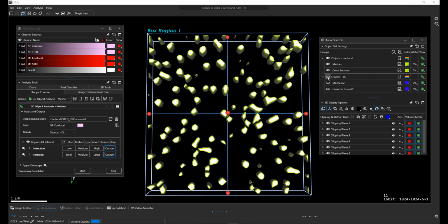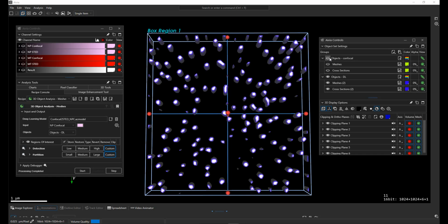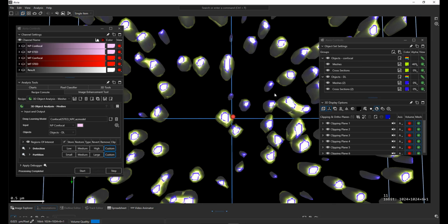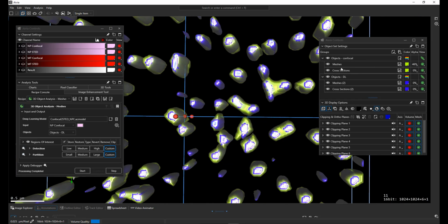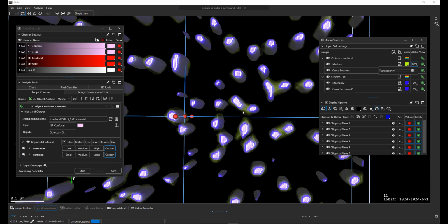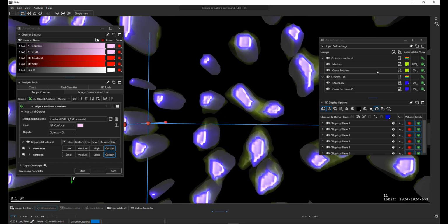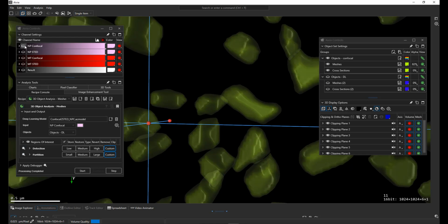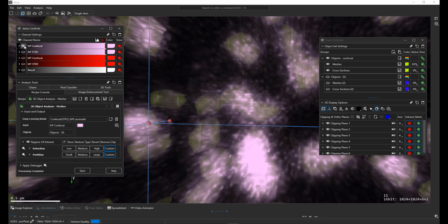So definitely the yellow ones are bigger. You can see the blue ones are inside, they kind of disappear. So first of all, they're bigger, and secondly, in quite a few cases, there are cells that are not partitioned properly, or nuclear pores that are not partitioned properly. So you can look closely here, for example, where with the confocal data, even though we tried really hard, it would still detect just a single big blob. And the raw data looks like this, so it's no big surprise that a big blob is detected.